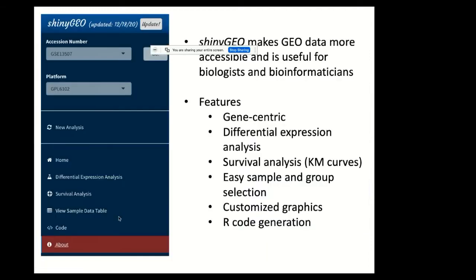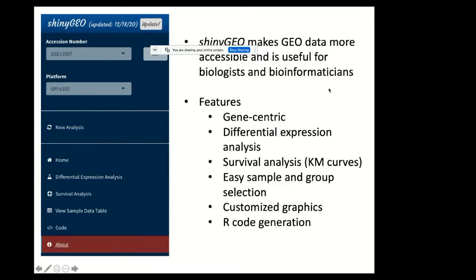The goal of ShinyGeo is similar, which is making GEO data more accessible, but it has some features that distinguish it from GEO2R. Namely, ShinyGeo is gene-centric, so the idea is if a researcher is interested in a specific gene, they start by selecting their gene, and then they can perform a differential expression analysis on that specific gene. They can also perform a survival analysis or the generation of Kaplan-Meier curves. In addition, ShinyGeo is designed for easy sample and group selection. It allows some customization of the graphics, and it also will generate the R code that's used for the analysis so that the analysis can be reproduced.